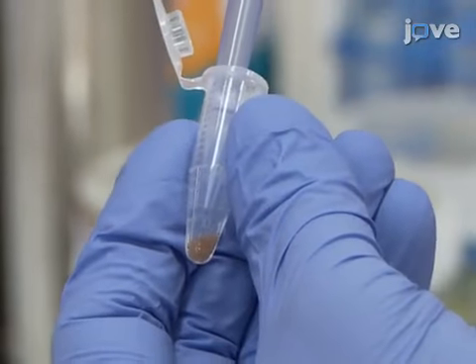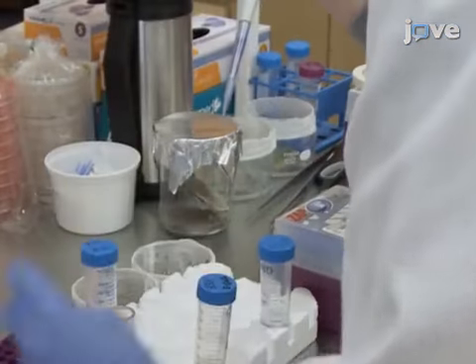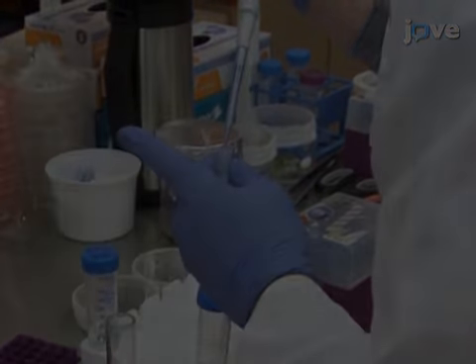Using a pipette, remove the water supernatant. Next, add 300 microliters of 2% sodium hypochlorite.